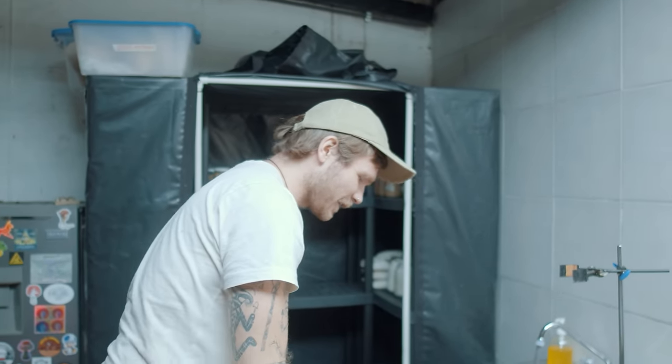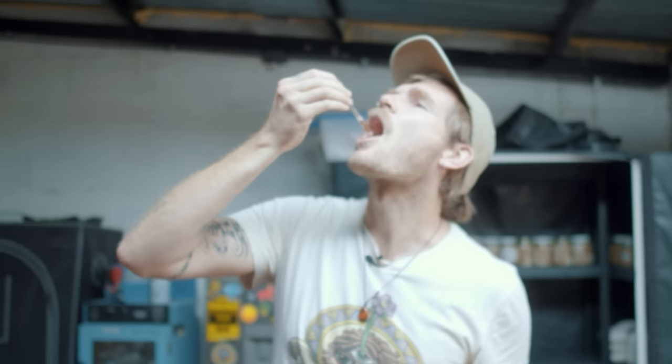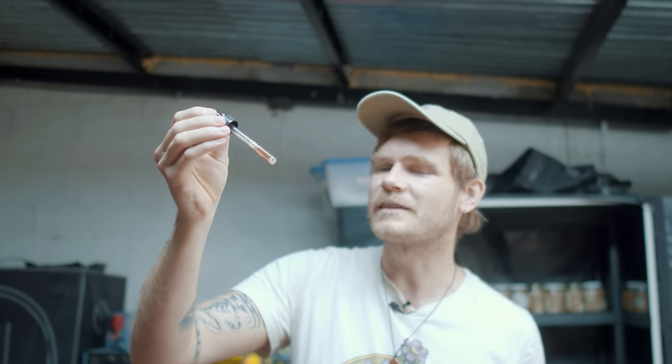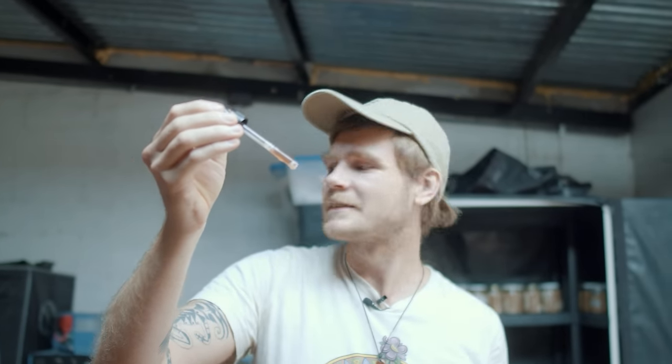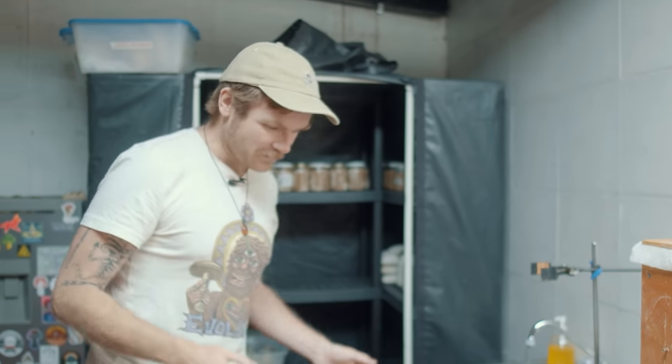I do a quick taste test. The color looks good — turkey tail doesn't get as dark as reishi, lion's mane, or cordyceps, but this is looking nice. I'm very happy with it. It's not too much alcohol flavor and it tastes really like turkey tail, which is important: if you make medicine it needs to taste like a really strong tea.